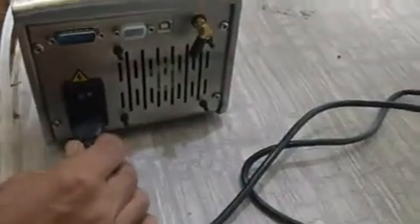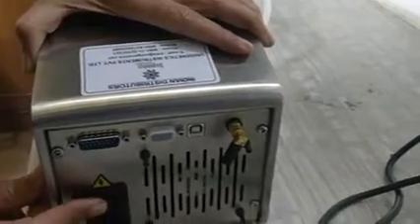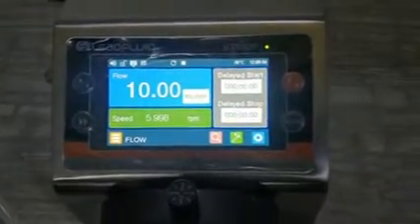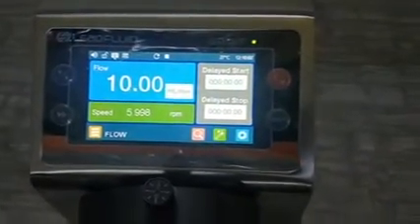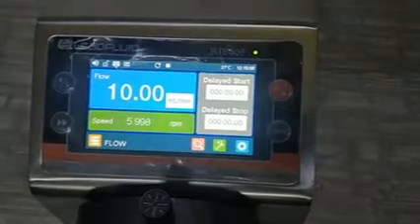This machine can take from 110 to 220 volts, so there is no confusion on the power. I have put the main power on and switched it to position one. Once you give the power, the pump initializes and comes to the main screen. As you can see, the display is very vibrant and full of colors — this is a very smart firmware.